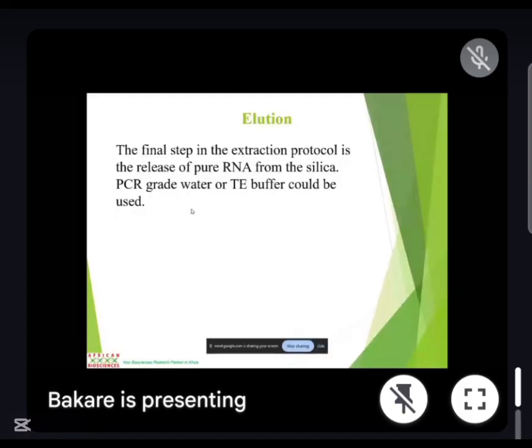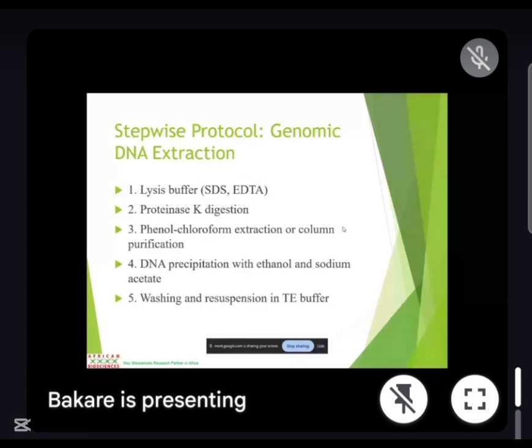The RNA will degrade. But let's say we just finished our RNA and our DNA now, and we want to use them next month. So we have to put them in the freezer, maybe 4 degrees Celsius, -20, -80. That's how we store.